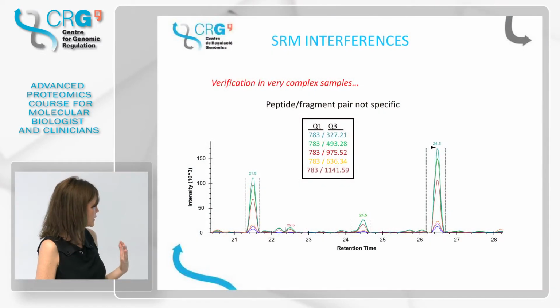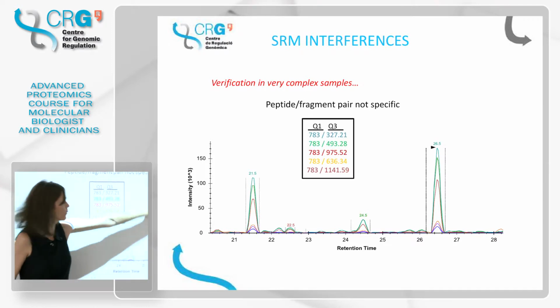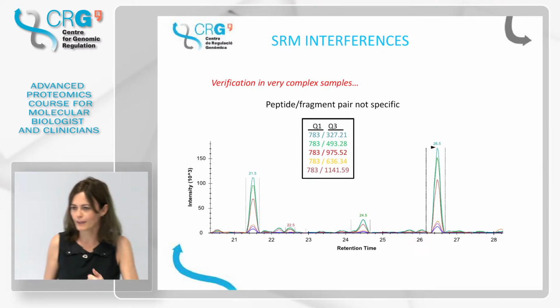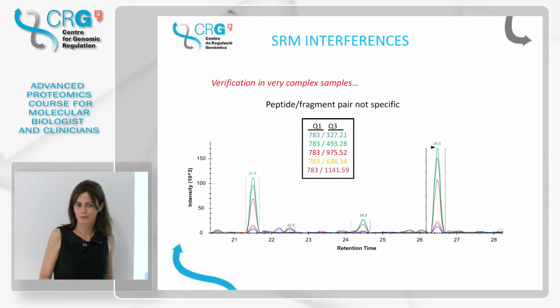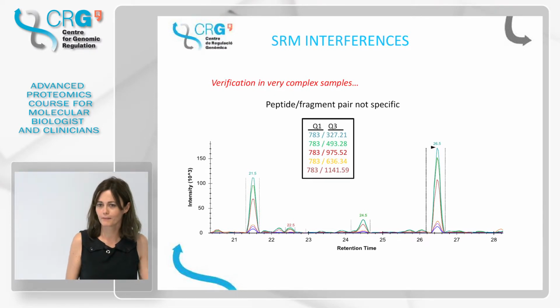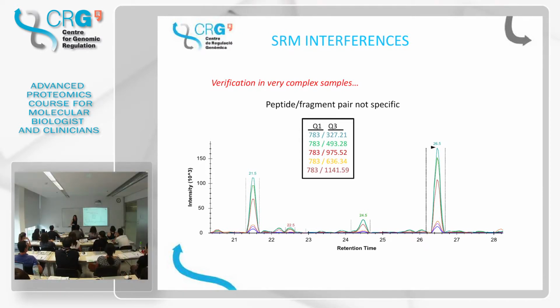which one is yours? Because what can happen is, imagine you don't have anything here and you only have this signal. You monitor your peptide and you get this. You say, great. Now you synthesize or you buy your heavy peptide and it happens to come out here. What is this telling you? That this was not your peptide, it was some interference, and you were happily monitoring the wrong thing. Maybe it was, I don't know, keratin, who knows. So the heavy peptide gives you the security.